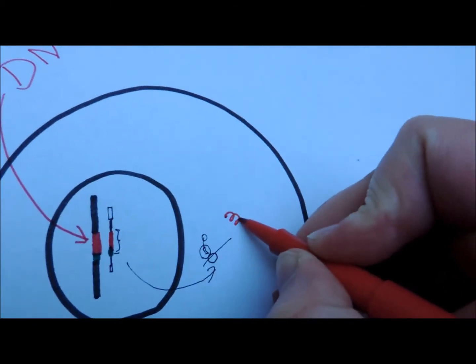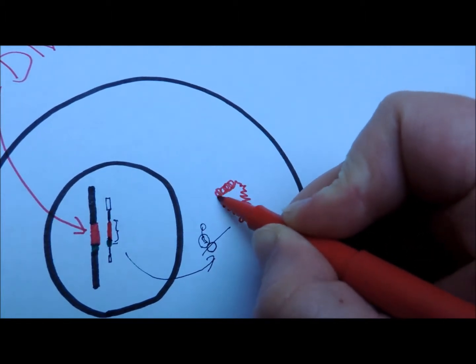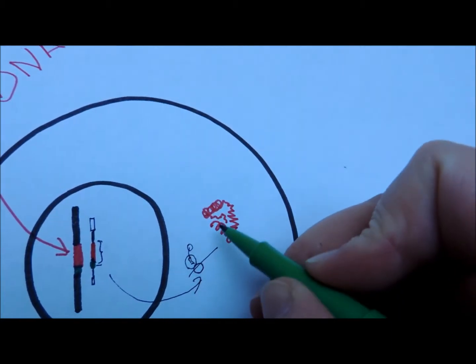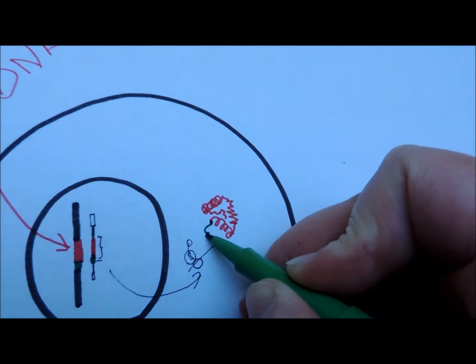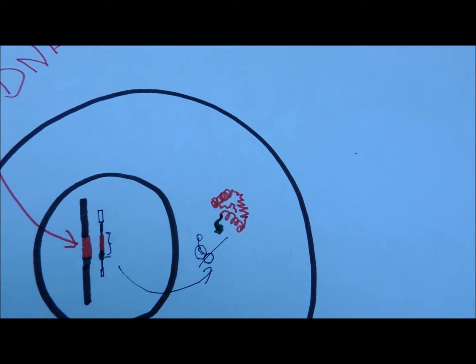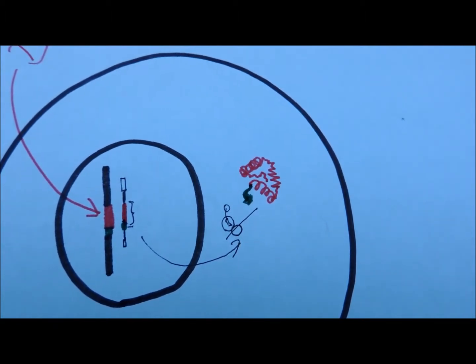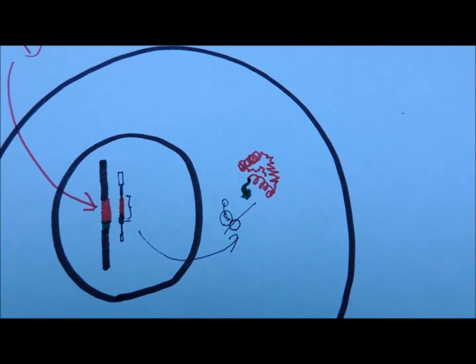Let's give our protein some alpha helices, maybe a beta sheet, some more alpha, some unstructured region. And then at the end, once it's finished reading that gene, what it's also going to end up reading is our GFP tag. Alright, and the GFP is going to cause this to glow, so that when we take a look at this cell, what we're going to see is that glowing GFP. So you'll actually be able to see where this particular protein is because it's literally going to be fluorescing.